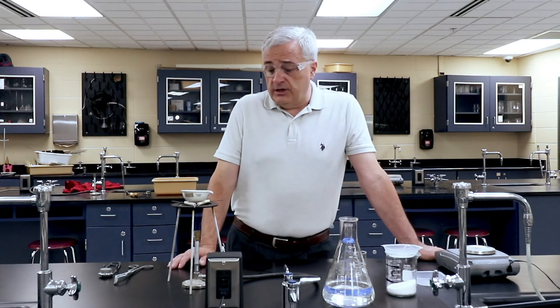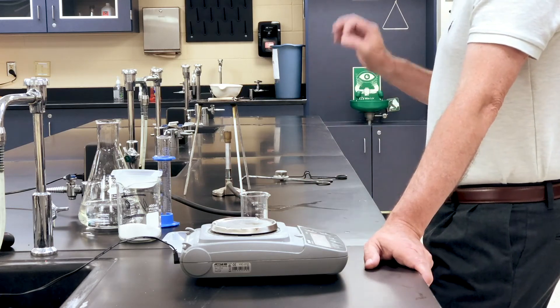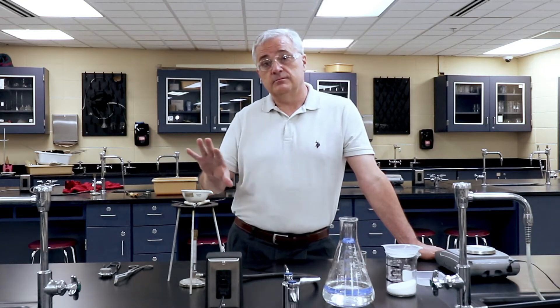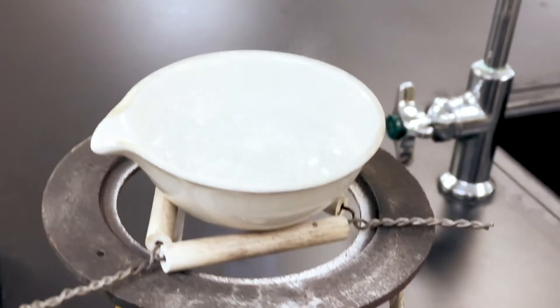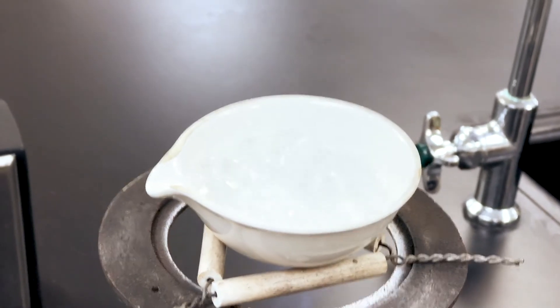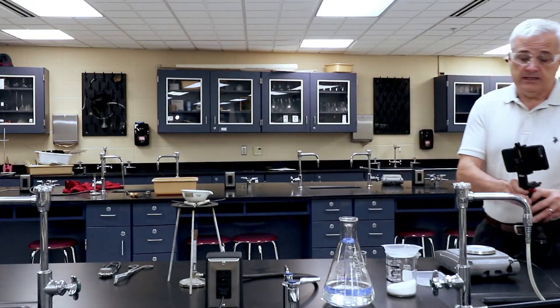For the results section, we've started the Bunsen burner. We are heating the water — it's going to come to a boil. The water has now come to a boil. So now we're just going to watch it boil until there's almost no water left. Once the water is mostly gone, we are going to look at the results.